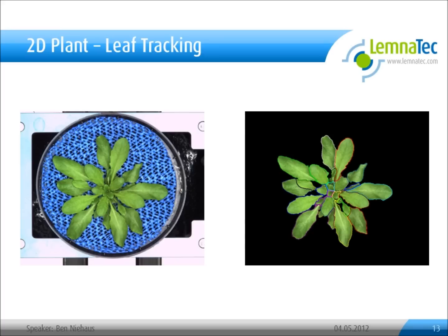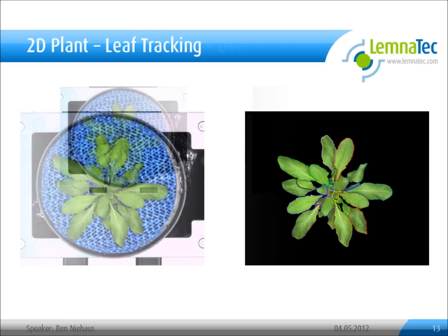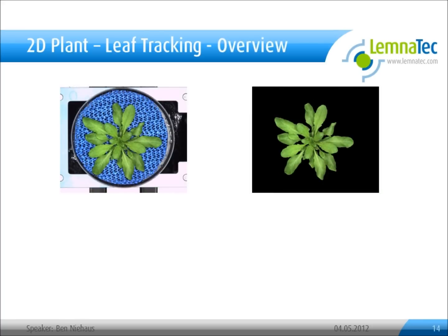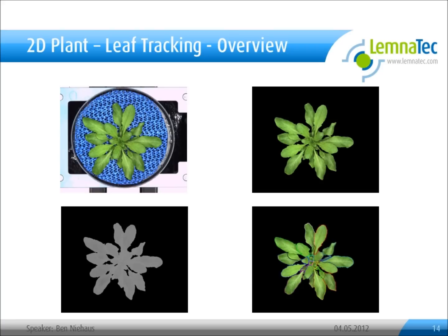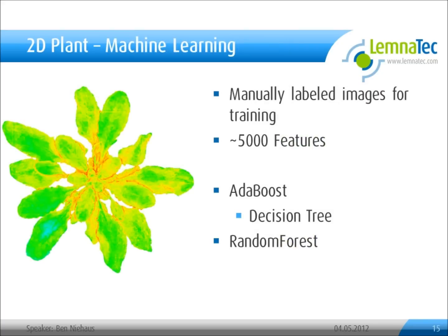We use a combination of machine learning and graph-based image segmentation to segment each leaf individually. First, we identify our object using foreground-background separation. Then a machine learning algorithm calculates the probabilities for each pixel, indicating that the pixel belongs to a leaf edge. On the left side you'll see the probability mask where red color indicates a high probability that the pixel belongs to a leaf edge. This mask was created by a random forest classifier trained with 5000 features and on manually labeled images.